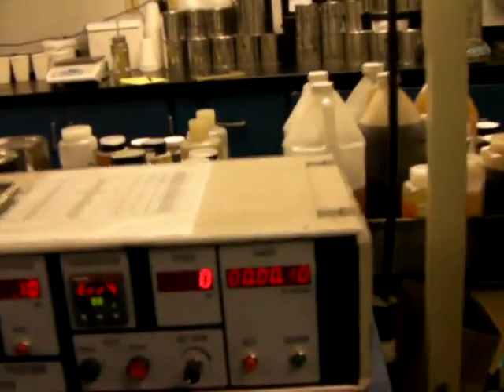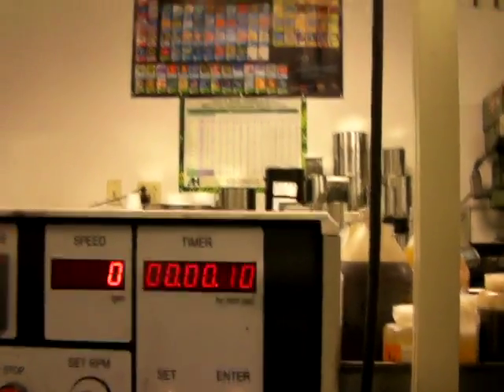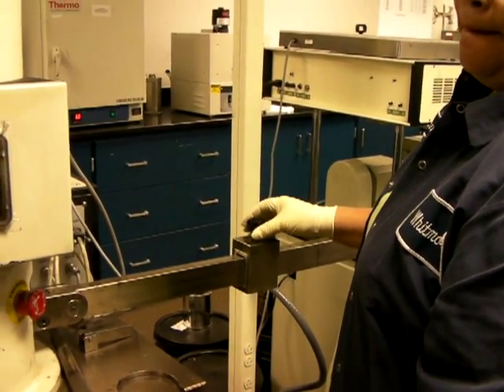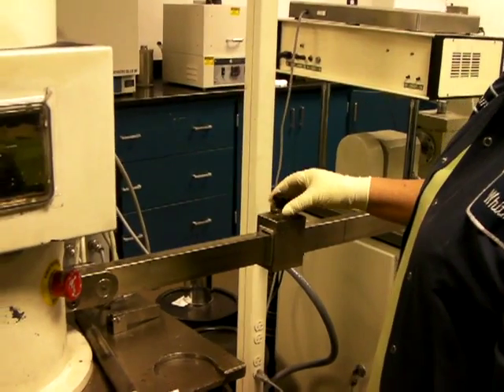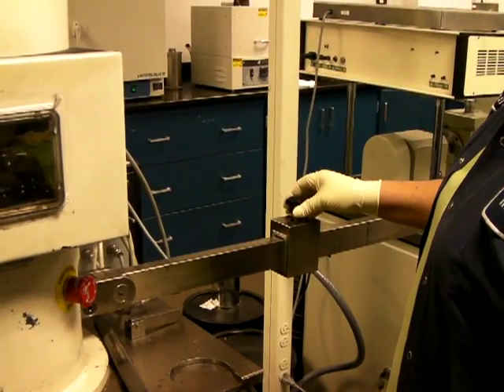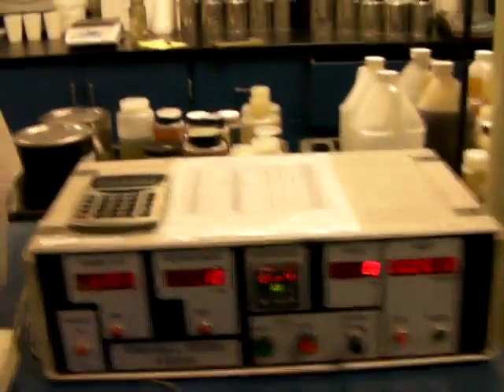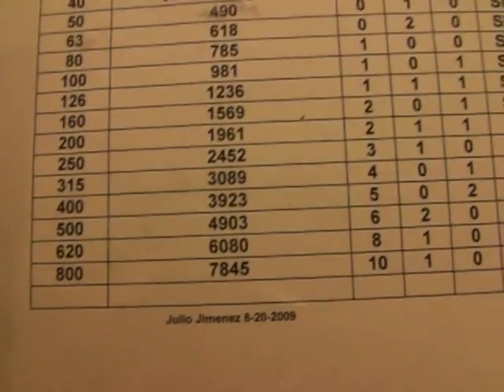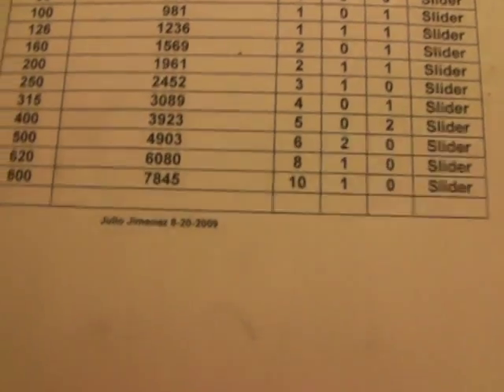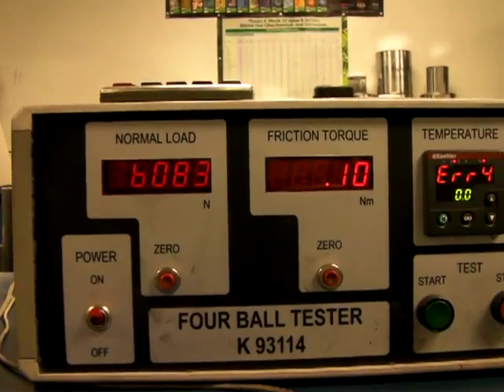The machine is set for 10 seconds. She's adjusting the fine tuning of the weight. She's keeping an eye on this computer — looking for 620 rather. We're looking for 6080 to appear here and she's got it pretty close. It's impossible to get it exact, but that's pretty close.